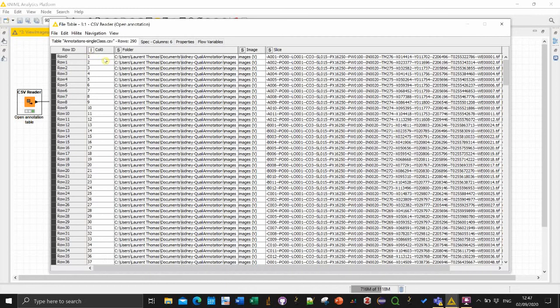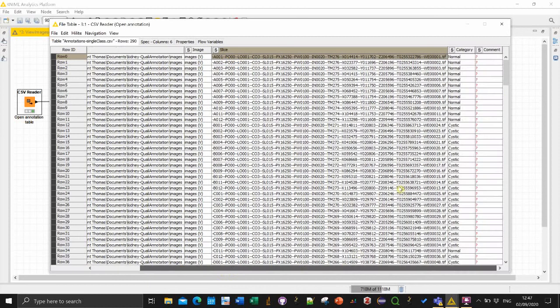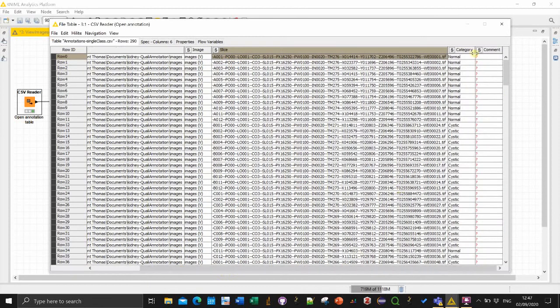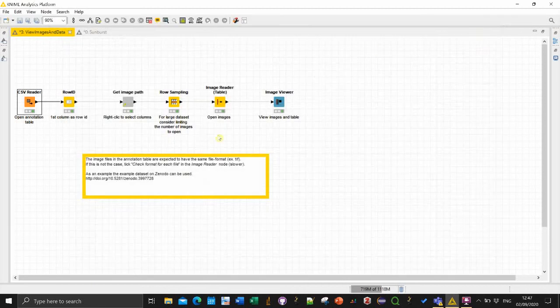So then you see a bit the content of your CSV. You recognize the index column, the folder column, the image when you have a stack and then the slice name. And in this case I just have a single category column and no comment.